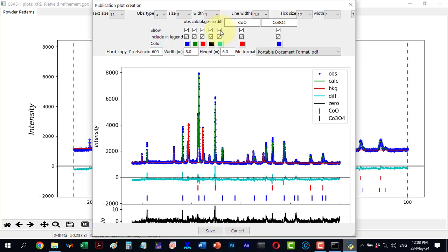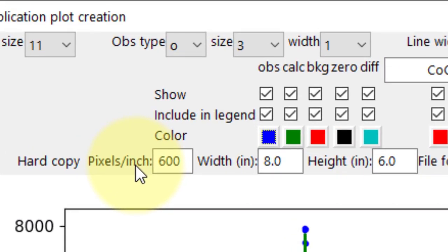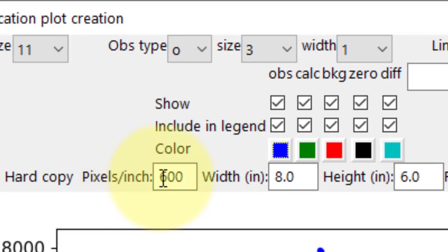Next is the pixel per inch setting. Journals usually require at least 300 PPI or DPI, and the default here is 600 PPI for high resolution.